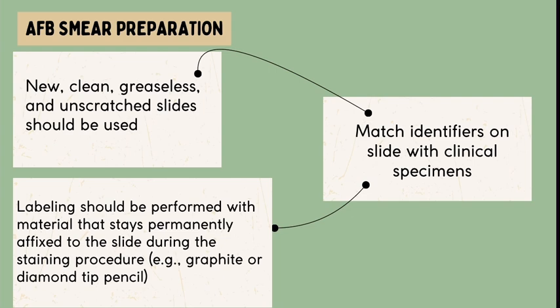So you need to get your new or clean, greaseless, and scratch-free slides. And then after that, if there are any identifiers, you should match them on the slide with the clinical specimen. And please take note that labeling should be performed with a material that stays permanently affixed to the slide during your staining procedure.